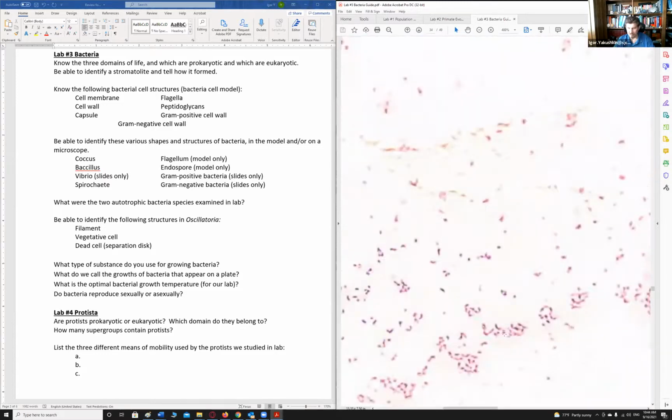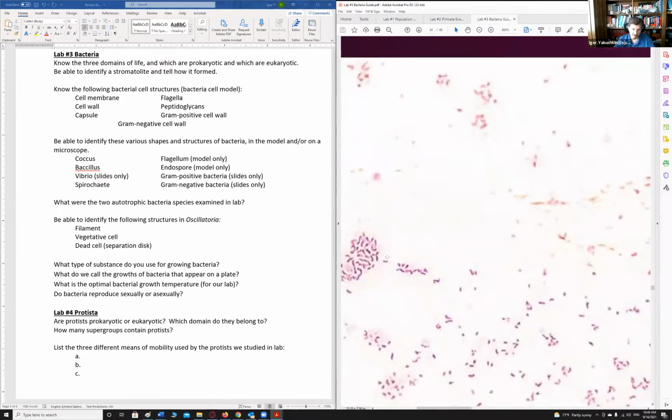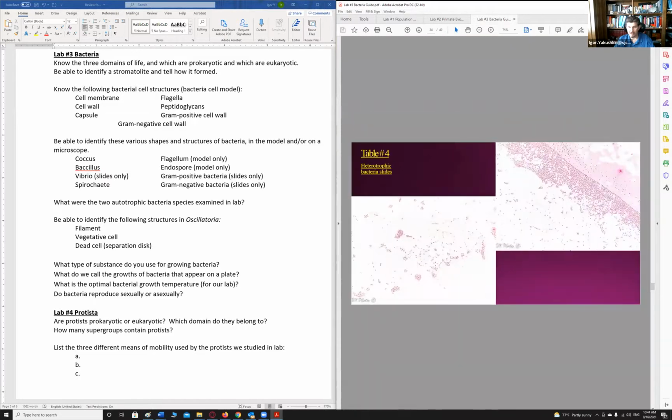Here we have the comma shape, the Vibrios. Again, under high magnification, you can see the comma shape of the bacteria, and also they are pinkish color, so gram negative. You can clearly see the comma right here, a bunch of them. So that one is cholera Vibrio.